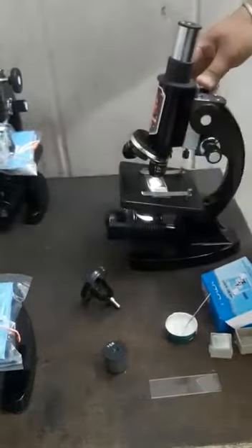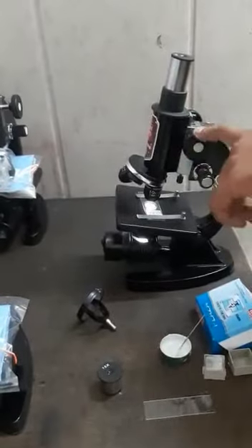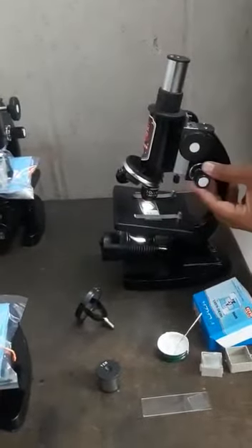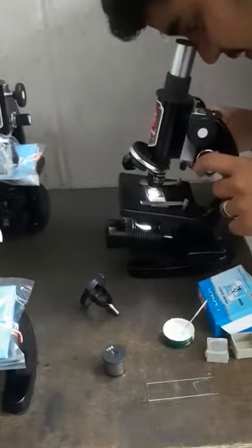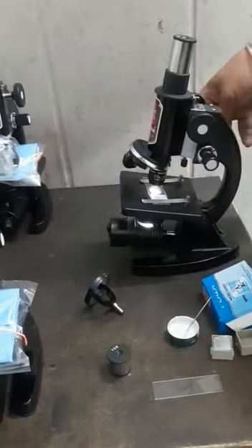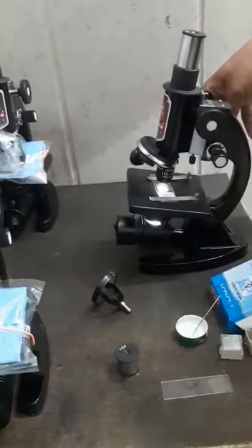I can see some results. If you see any blurriness, just use the fine motion to sharpen the image. I can now see proper results of the specimen in this microscope, having taken all the necessary measures for a good result.